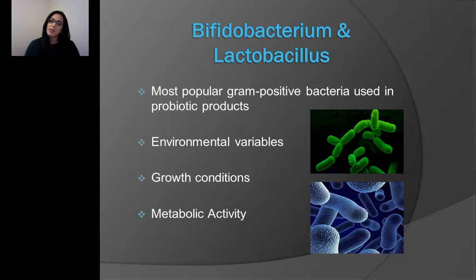And we do that by eyesight. For example, Lactobacillus colonies will be a little bigger, and Bifidobacterium will be a little smaller.